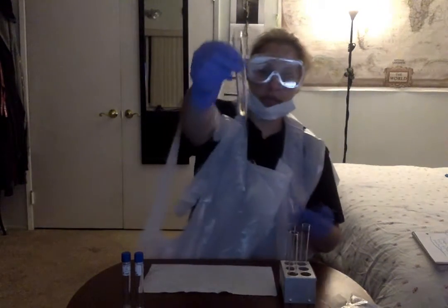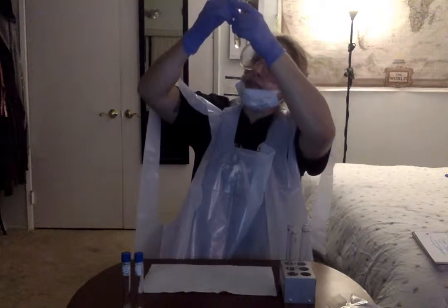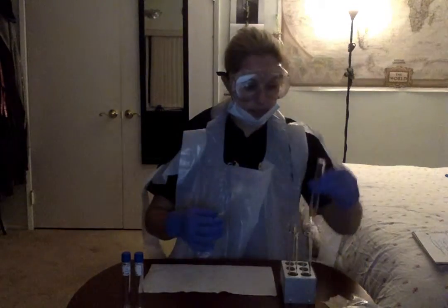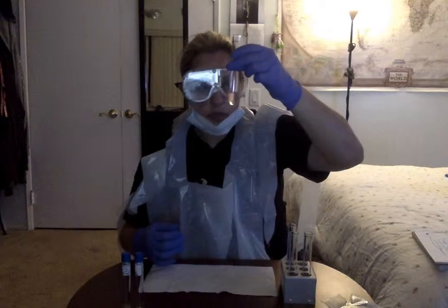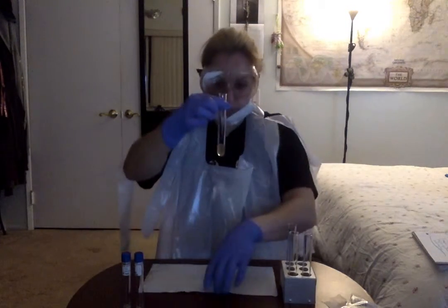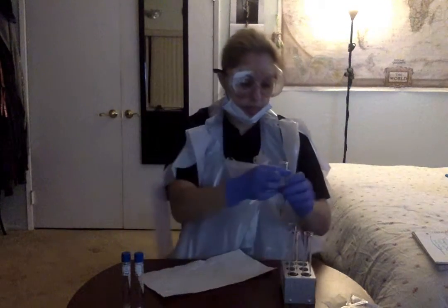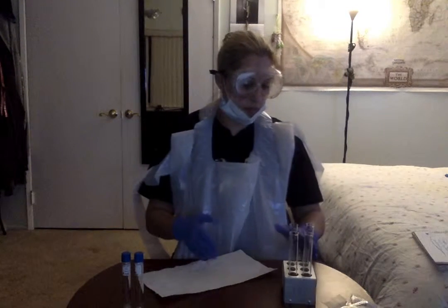The results are right here. The E. coli, you can see, is actually kind of clear. There's not really much in here. So that's the E. coli, which I'm going to say is a negative. And then this is the S. epidermidis. It's kind of hard to tell, but it did develop sort of a pinkish on the top layer. It's kind of hard to see. I was actually expecting more of a red. Maybe it's a little bit easier if I put a little bit of white. You could see some pink in there. And so I'm going to assume this is positive because of the pinkish.